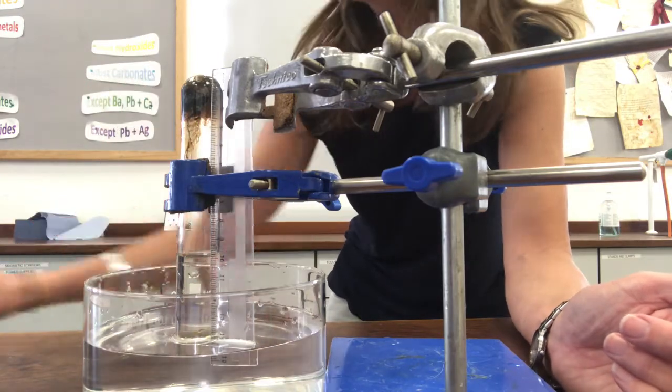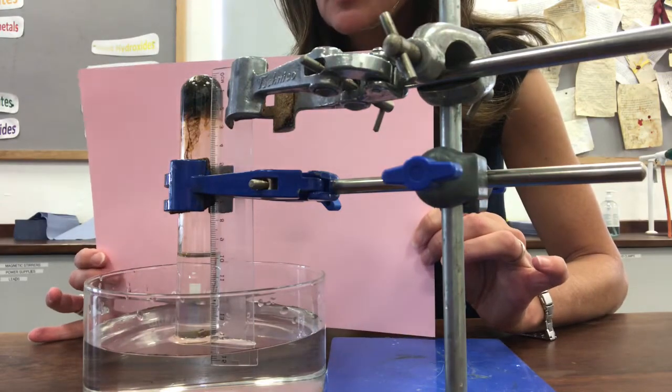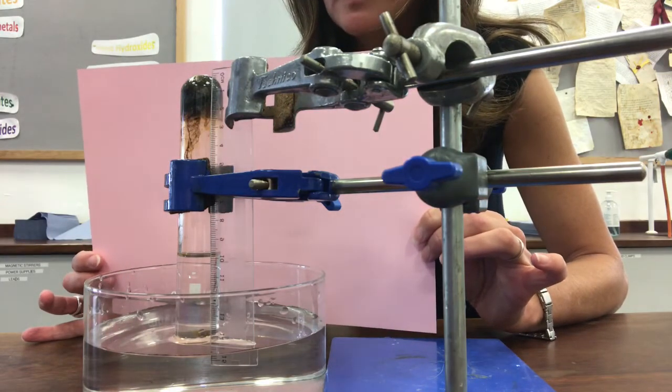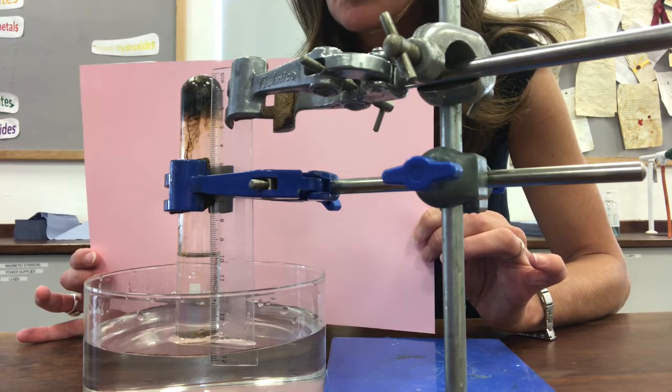I want to hold this pink card behind so that you can read off the length of the air bubble now. It was 12.5 when we set it up, and I hope you'll agree that it looks like it's about 10 centimeters now.